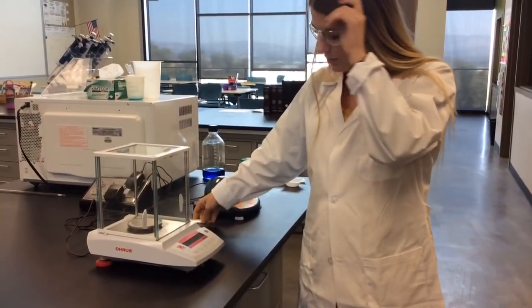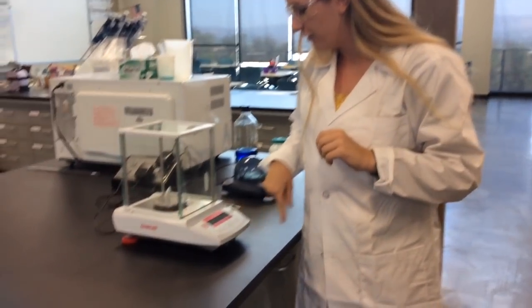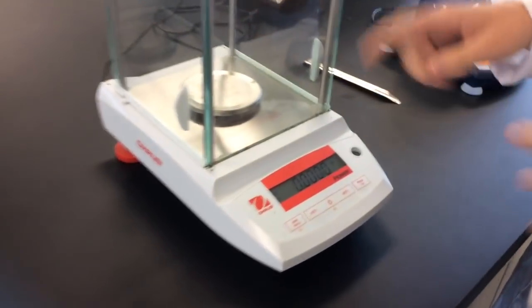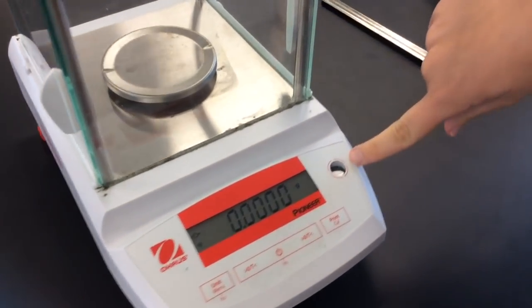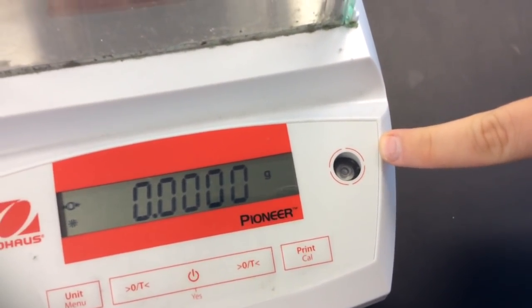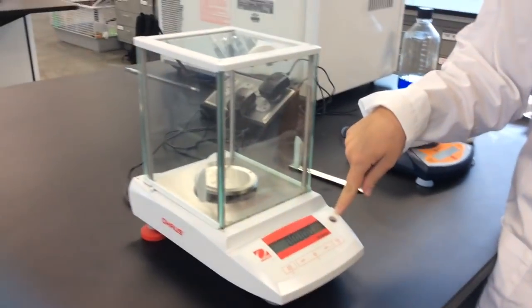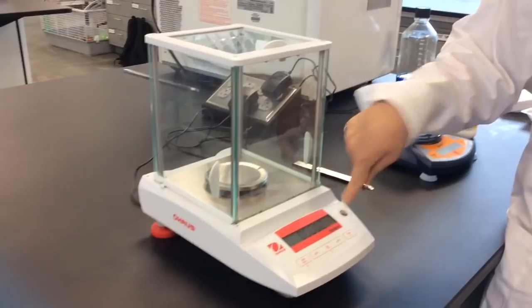In order to use this analytical balance, first things first, we want to make sure that it is balanced. We have this little bubble thing, and it is calibrated currently. If it is not and it is off-center, please come get one of us and we will help you fix it.